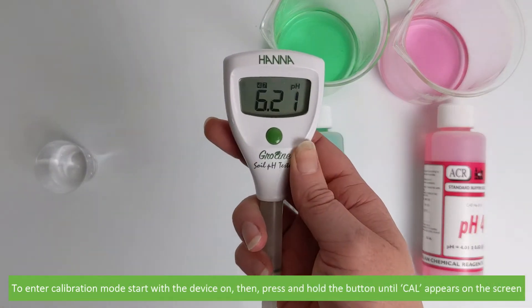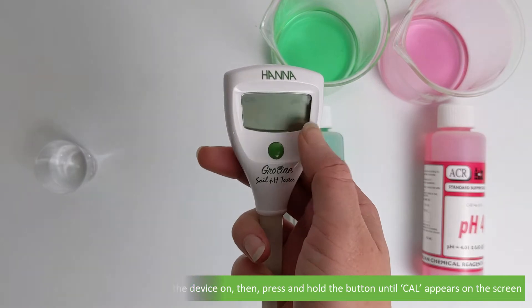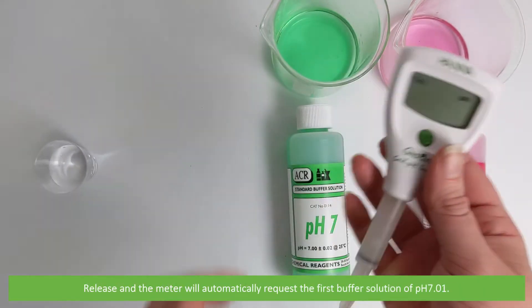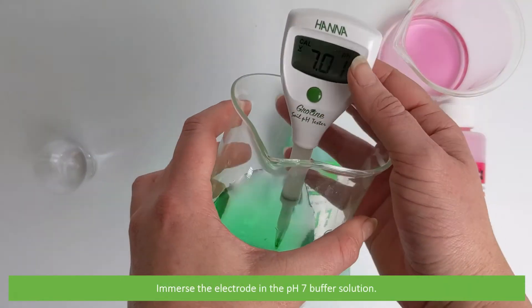To enter calibration mode, start with the device on then press and hold the button until CAL appears on the screen. Release the button and the meter will automatically request the first buffer solution of pH 7.01. Immerse the electrode into the pH 7 buffer solution.